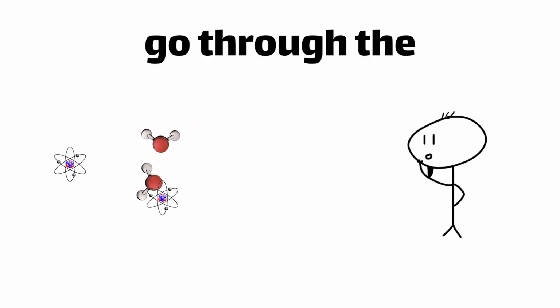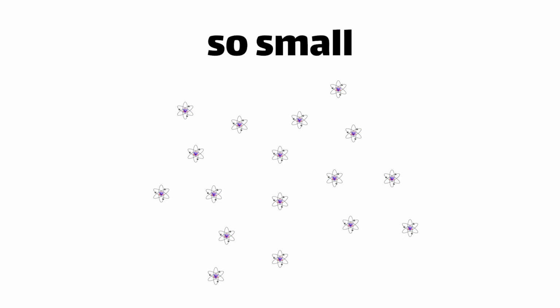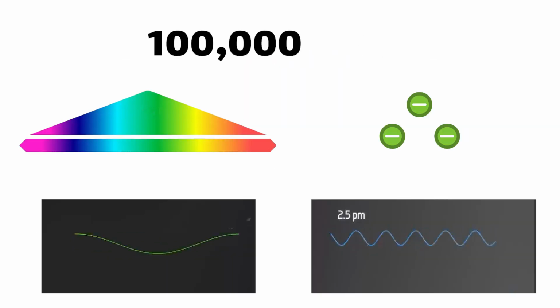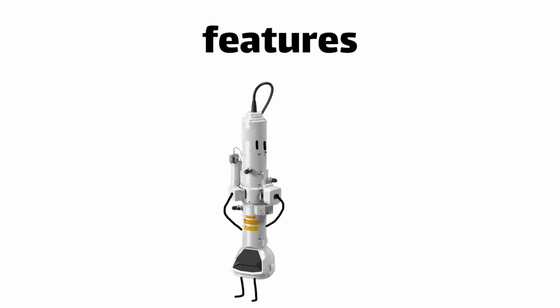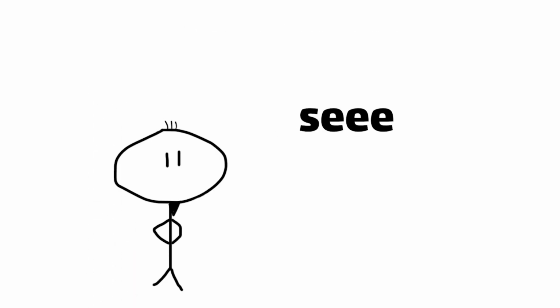Now, in case you're wondering why one would go through the hassle of using an electron beam to look at stuff, well, light microscopes are great for seeing things down to a few hundred nanometers, but things on the atomic scale are so small, they require a bag of new tricks to be seen. The advantage of electrons is their incredibly small wavelengths compared to visible light photons. Thanks to their incredible velocities, electrons have wavelengths over 100,000 times shorter than visible light photons. This means they can pick up on details way too small for light to detect without getting totally blurred and diffracted away. Because of this, electron microscopes can discern angstrom features that would be hopelessly blurred by the longer wavelengths of light-based techniques. This ability to see at the atomic scale is what gives them unparalleled vision in the nano-world's uncharted landscapes.